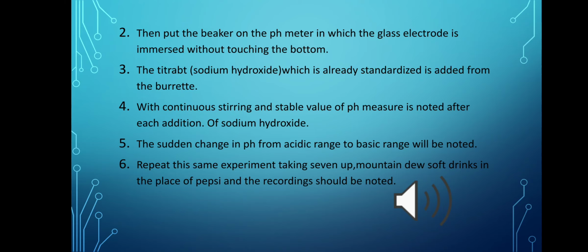10 ml of Pepsi is added in a beaker and also add 40 ml of distilled water in it.